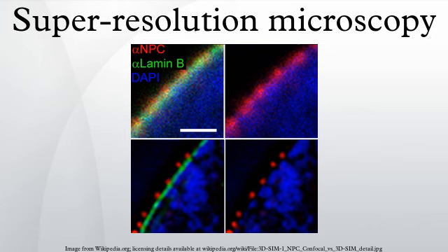The desirable traits of fluorophores used for these methods, in order to maximize the resolution, are that they should be bright. That is, they should have a high extinction coefficient and a high quantum yield. They should also possess a high contrast ratio. Also, a densely labeled sample is desirable according to the Nyquist criteria. The multitude of localization microscopy methods differ mostly in the type of fluorophores used.